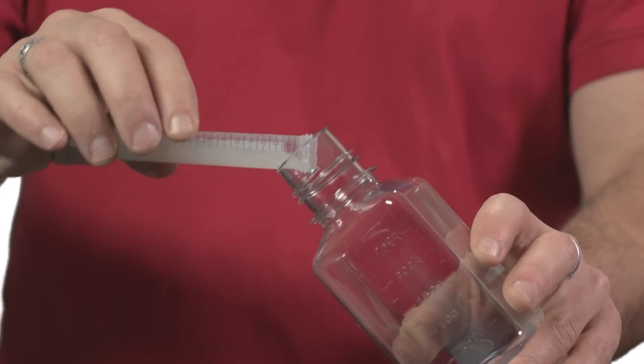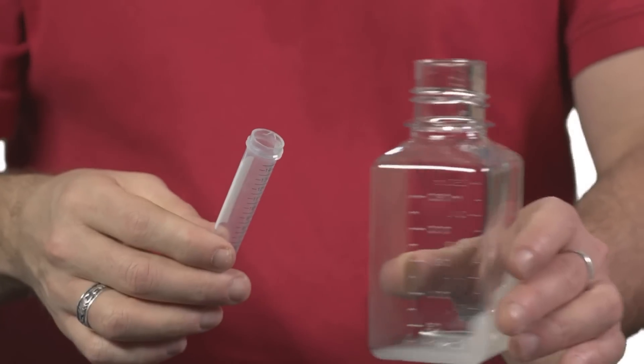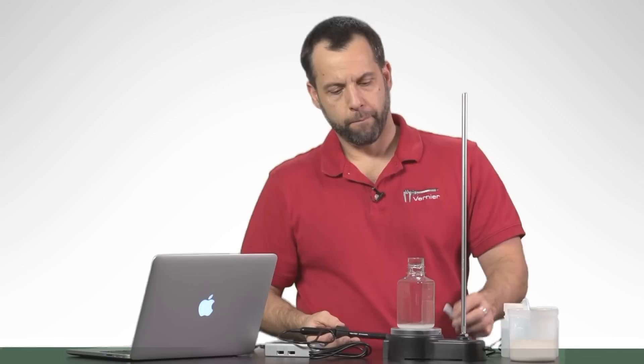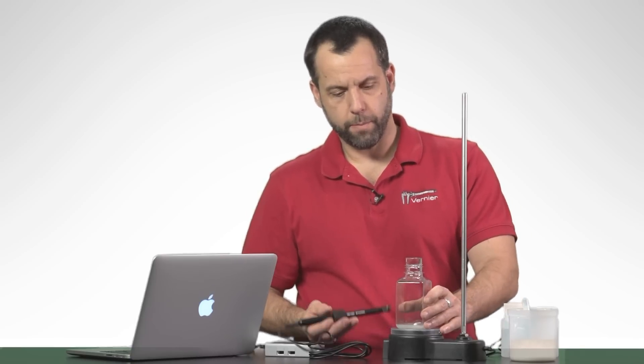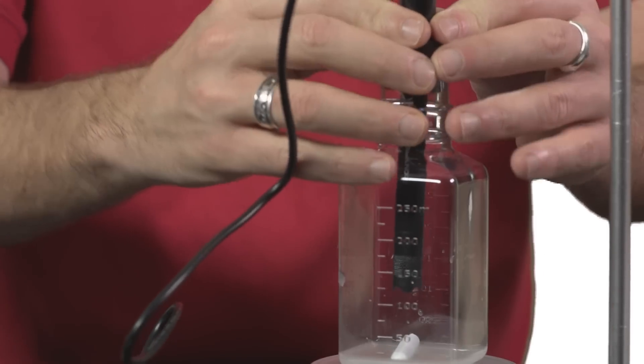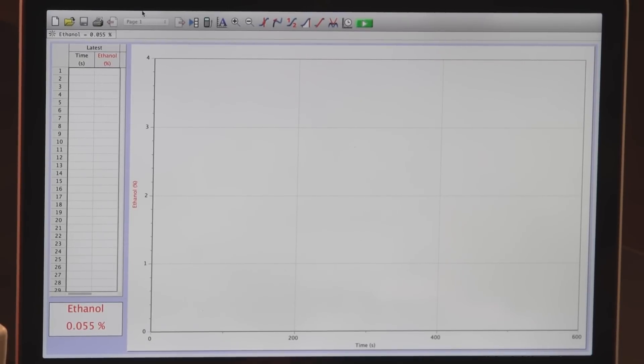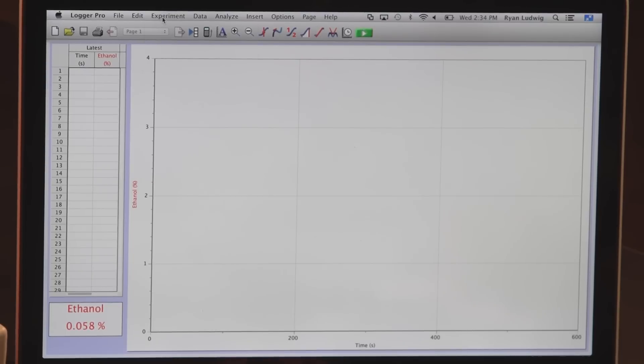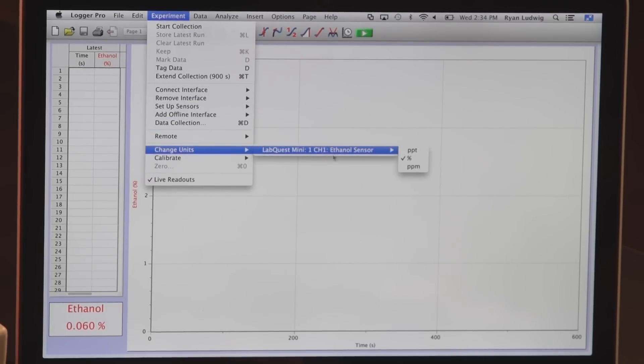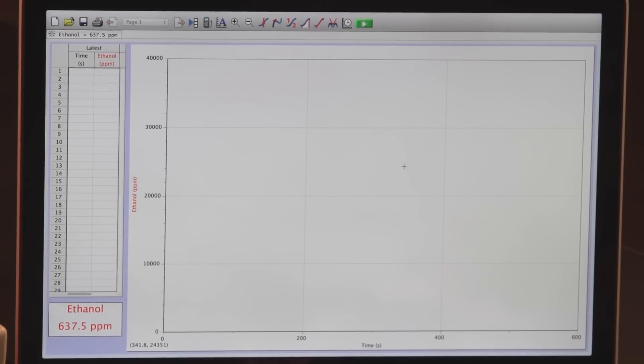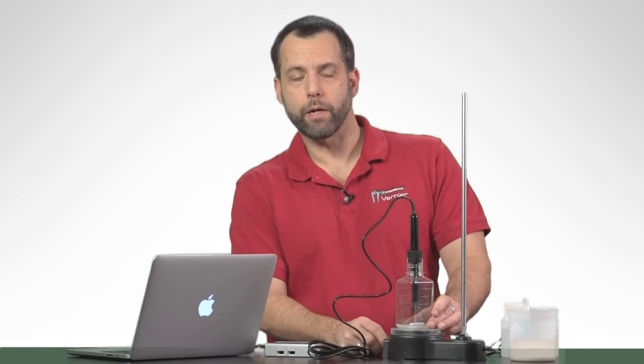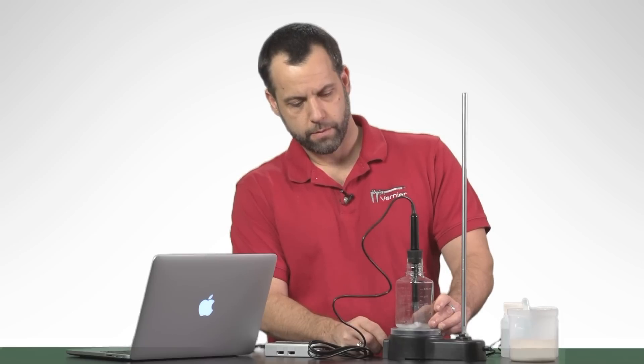Then I pour the yeast suspension with the glucose into the bottle. Then I put the stir bar into the chamber, put the ethanol sensor into the chamber. Real quickly before I start this experiment, I'm just going to change the units over here of the ethanol sensor in LoggerPro by going to the experiment menu and going to change units, ethanol sensor. I just like to see this in parts per million. You can leave it in percent but I like having it in ppm. And then now I'm going to turn it on. It's going to make some noise and then I'm going to hit the collect button.